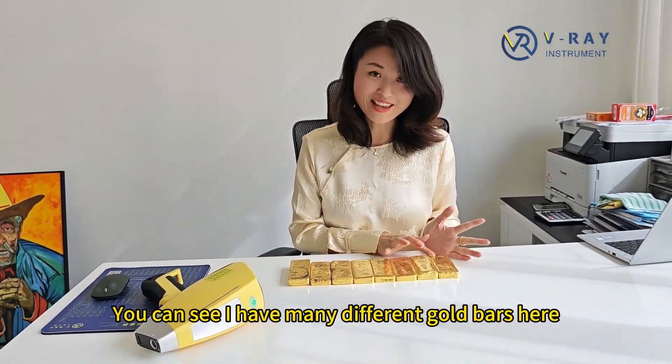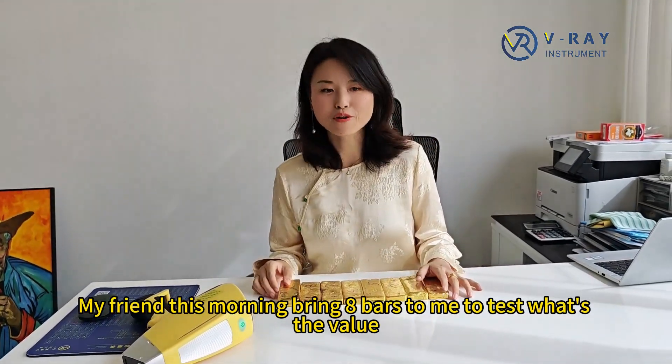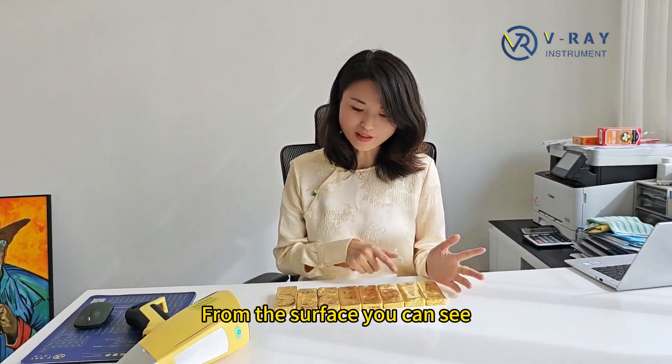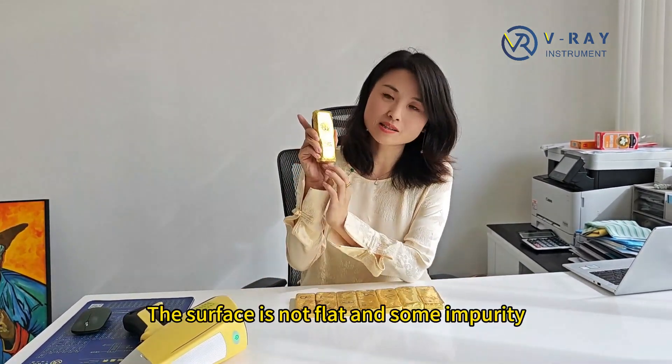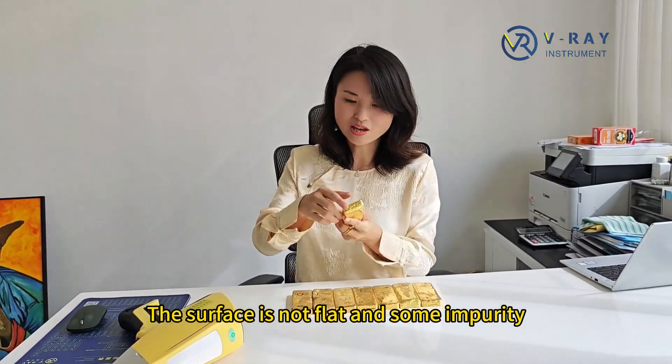I'm so rich now. You can see I have many different gold bars here. My friend is wanting to bring that bar to me to test what's the value. From the surface, you can see it's not a standard gold bar. The surface is not flat and there are some impurities in it.